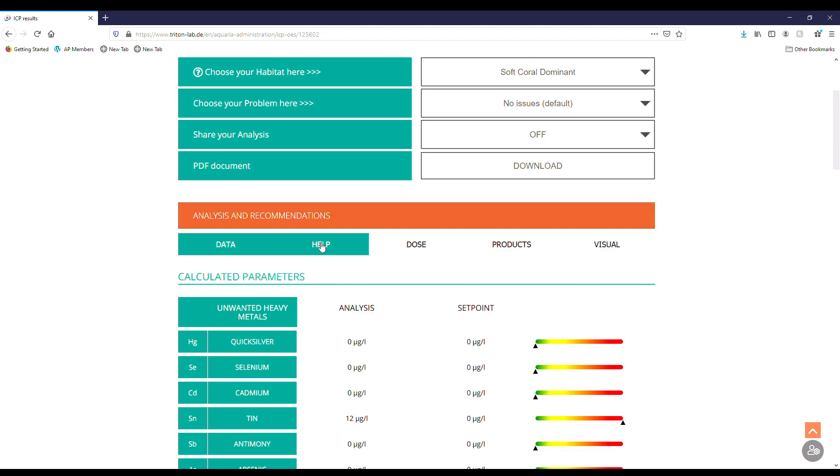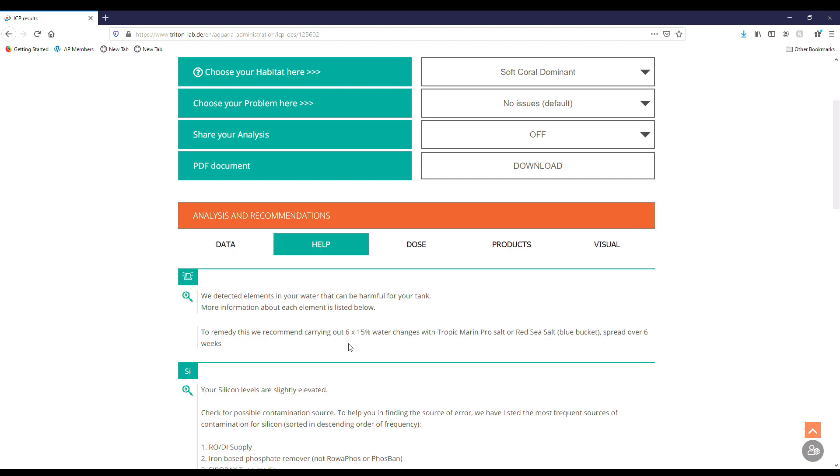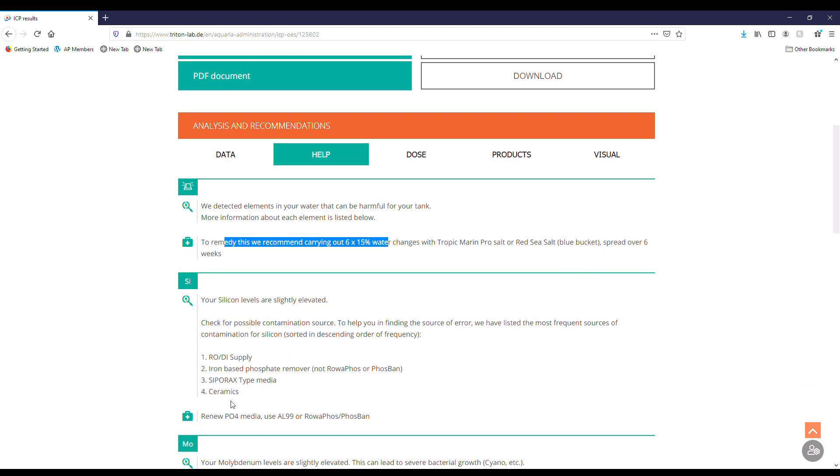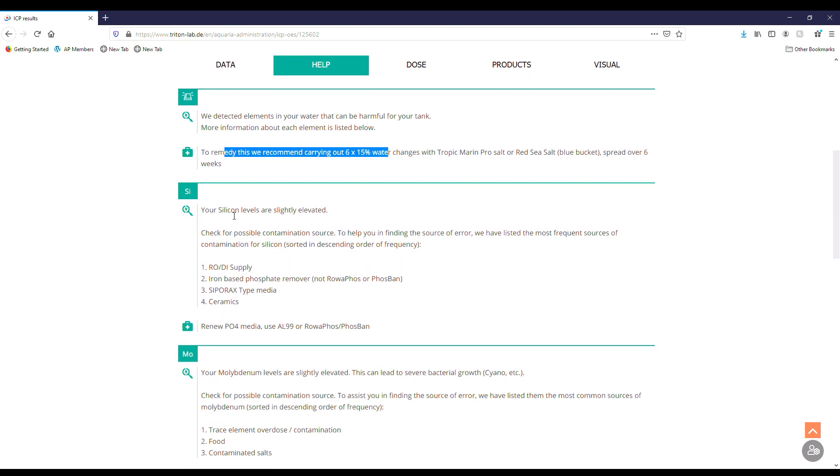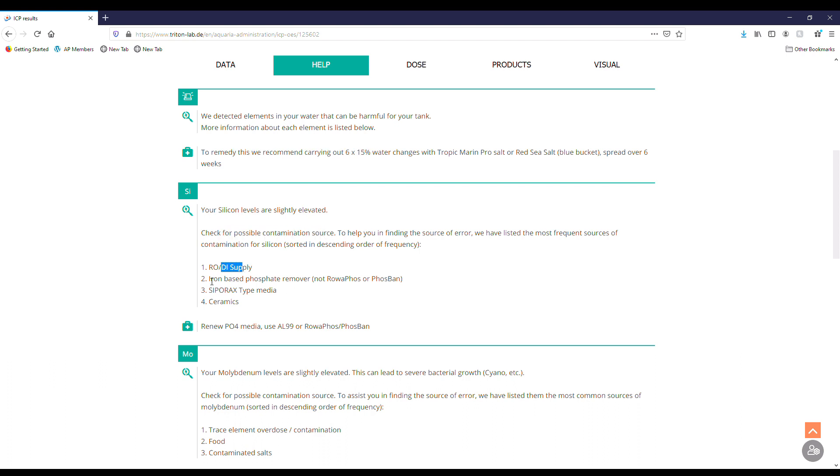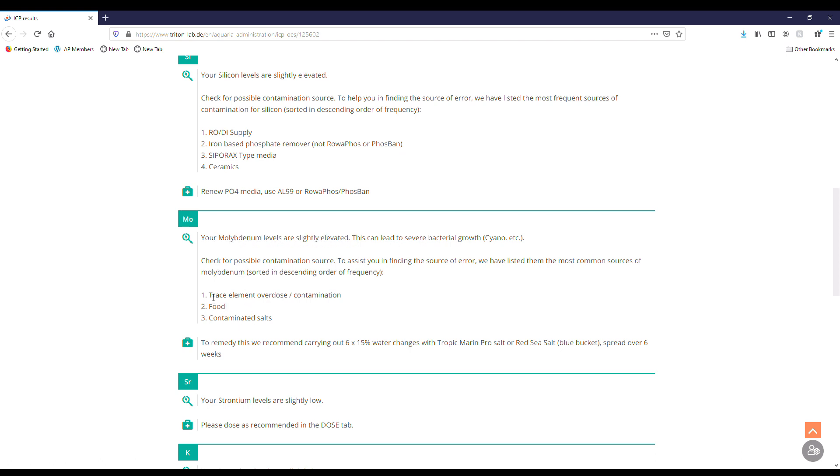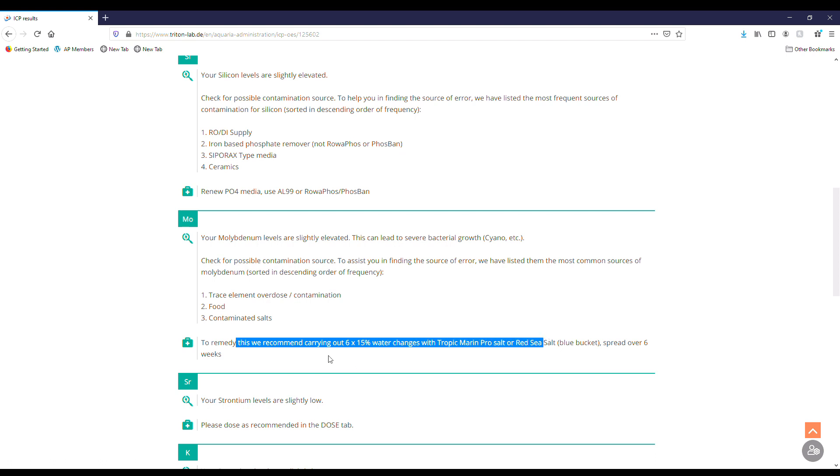Next we have help up here. We can click on this and it's going to tell you about elements that are harmful for your tank and what maybe we're going to do. They recommend six by 15% water changes and then doing salt with Tropic Marin Pro or Red Sea over six weeks. Silicone high or slightly elevated, so we definitely want to be checking out RODI like I said. Ferric oxide, Siporax, ceramics, some of those could also be a cause. I don't do any of those, so most likely it should be my RODI. Molybdenum is slightly elevated, so that could lead to cyano and some other bacteria growth. We want to look at our trace element overdose, possibly food, or possibly contaminated salt. Again, recommend water changes here.